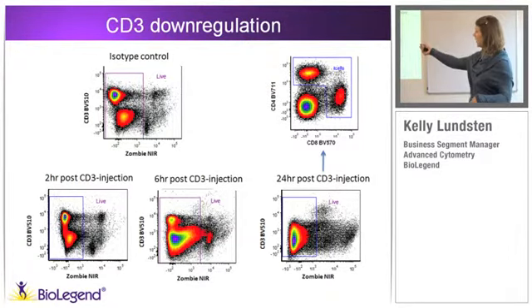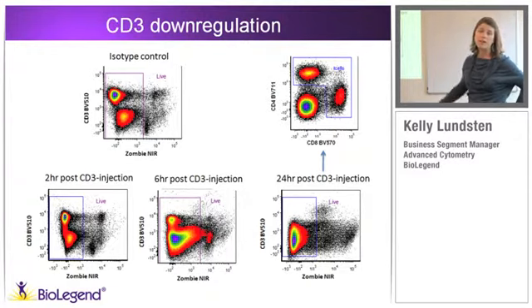The one that I'm showing you here is at 24 hours, and my CD4 versus my CD8 looks absolutely gorgeous, and that's using the BV570 and the BV711 in that bivariate. Again, two fluorophores that do not have a lot of spillover into one another.